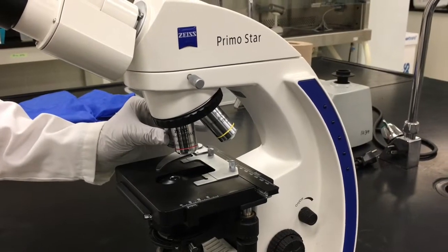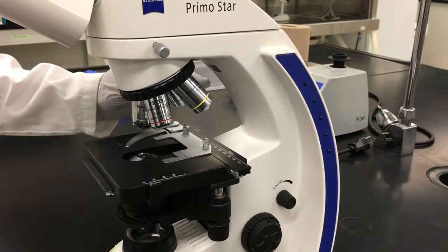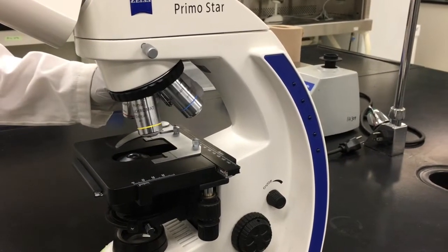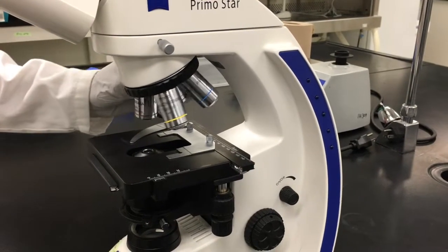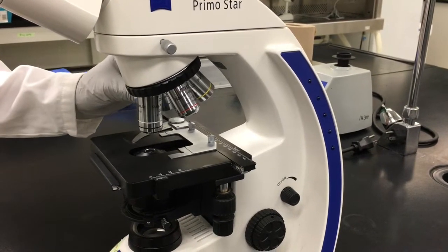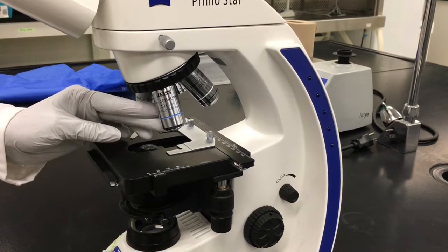In order to change the magnification, you simply rotate the objective lenses as shown here. The red corresponds to the 4x magnification, the yellow is the 10x, the blue is the 40x, and the white is the 100x magnification.